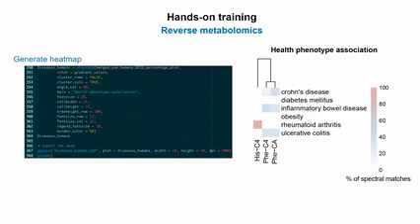But again, you have to inspect the MS/MS spectrum. You have to inspect it, and ask: does it make sense biologically that these organisms will produce it? If it doesn't make sense, then it's maybe just a false annotation. It's also possible that those peaks will have a higher delta mass than 0.05, or it will be 0.05, but I would not necessarily trust it if it's a high-res mass spec. So I think you always have to question your data. The manual inspection of the matches is very, very important, depending on the class of molecule you're doing. Okay, so it's up to the user. Yeah, it's up to your user.